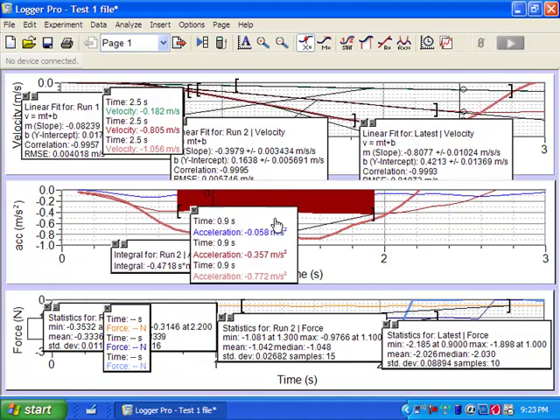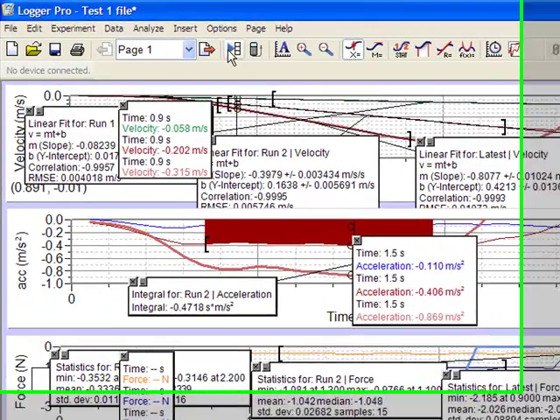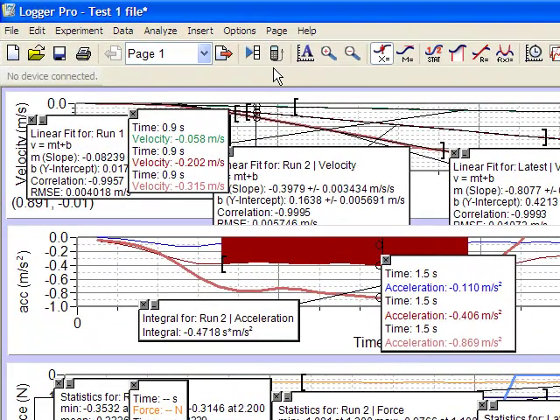All right. So I hope that's helpful in figuring out how to do things. I strongly recommend that you do download the Logger Pro file and Logger Pro program and try it out somewhat for yourself so that you're ready to do these things when it comes time to do them on a test or in a lab.